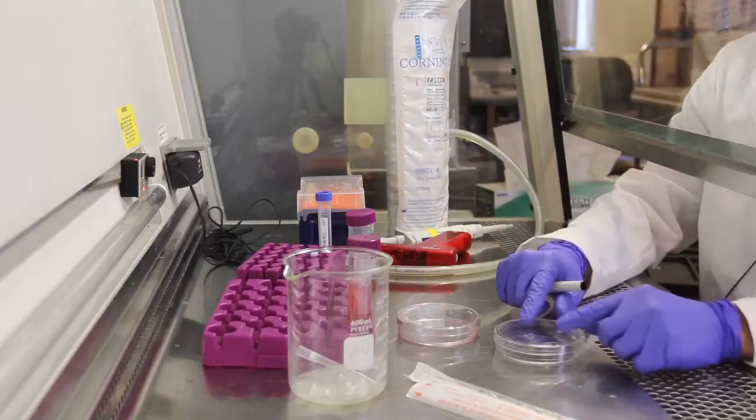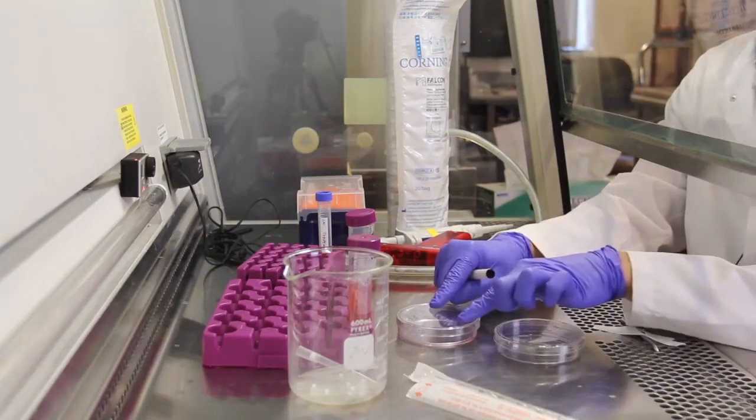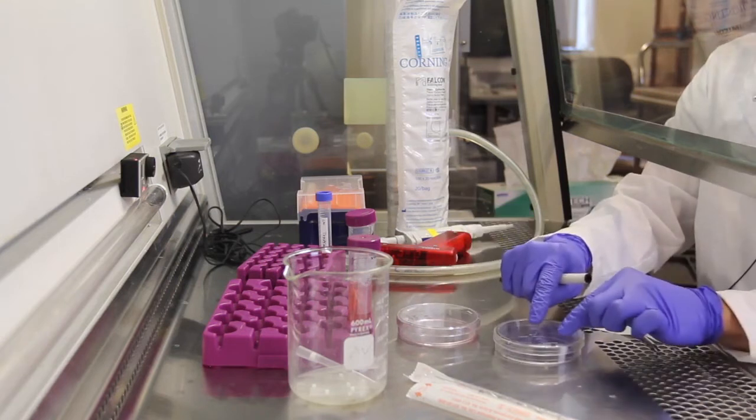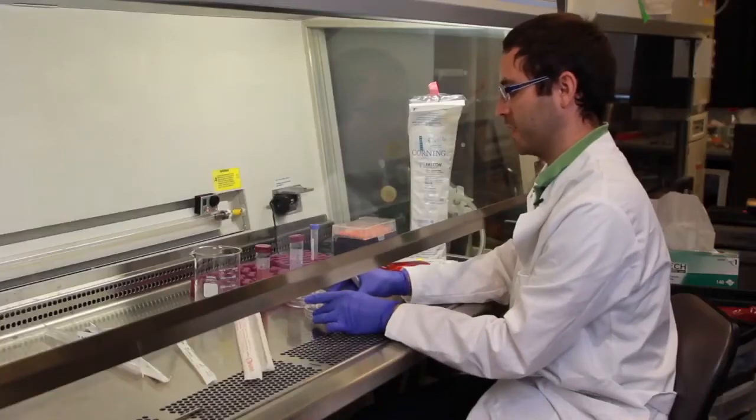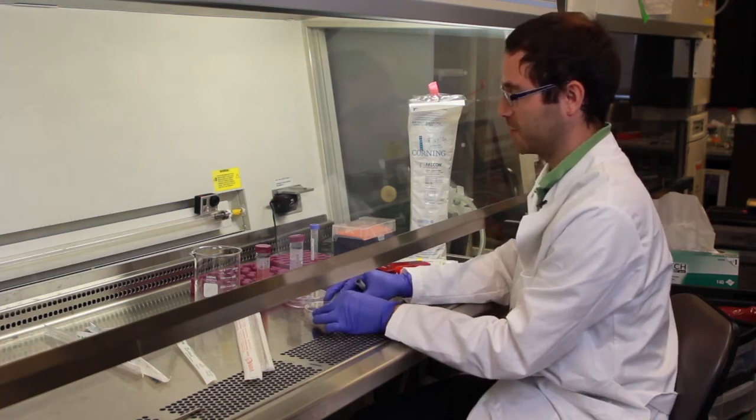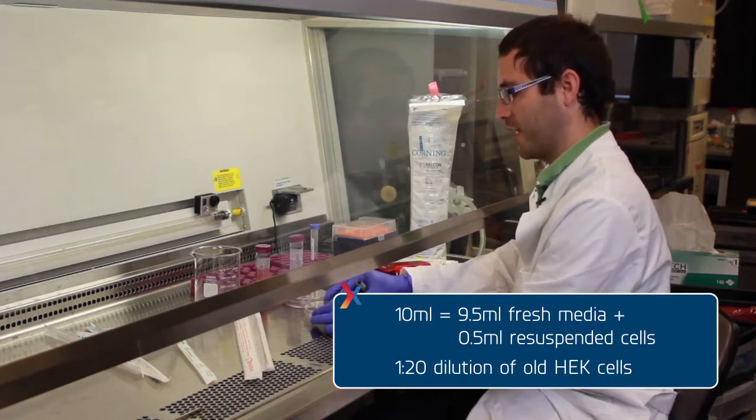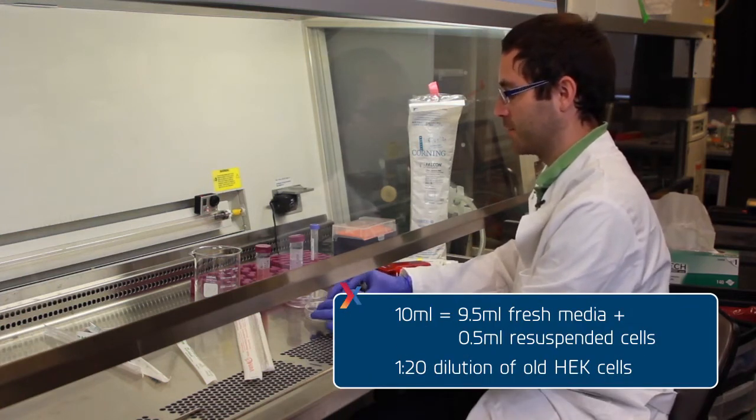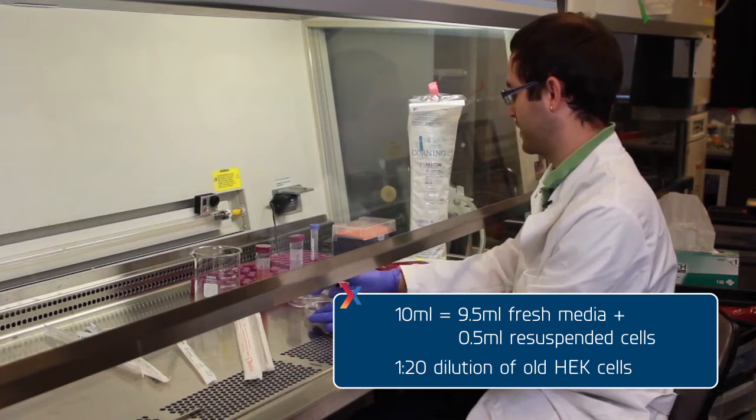A 1 to 20 split basically means that you take the original cells and dilute them by 20 fold onto this new plate. Since the final volume will be 10 milliliters, a 1 to 20 dilution means you'll need 9.5 milliliters of fresh medium and 0.5 milliliters of resuspended cells.